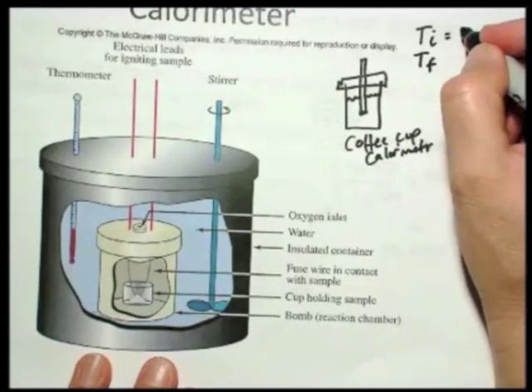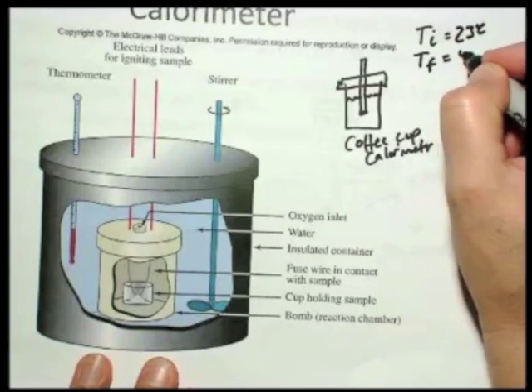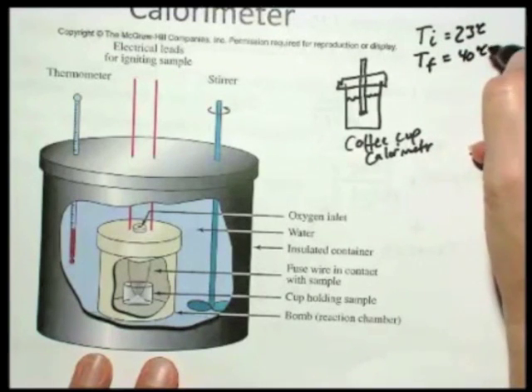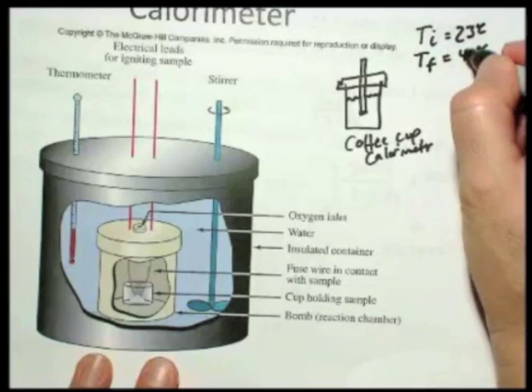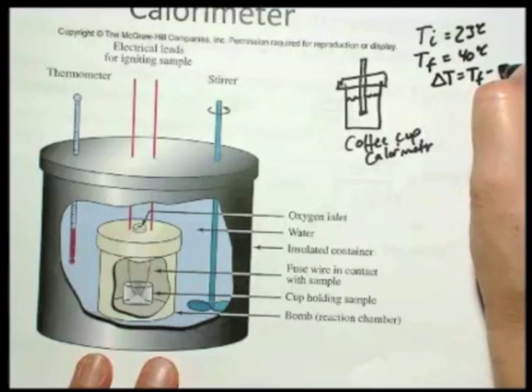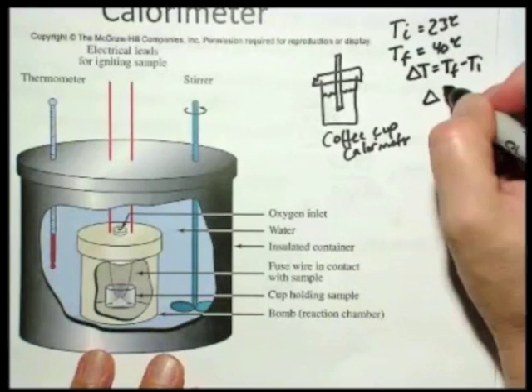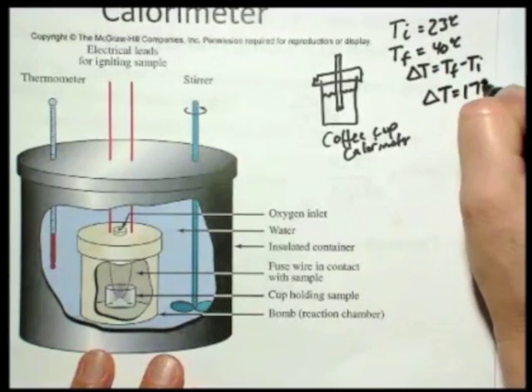So say you start off at like 23 degrees Celsius, and you end up at 40 degrees Celsius when you're finished. From those two numbers you get the change in temperature, which is always the final temperature minus the initial temperature. In this case, it would be a 17 degree temperature change.